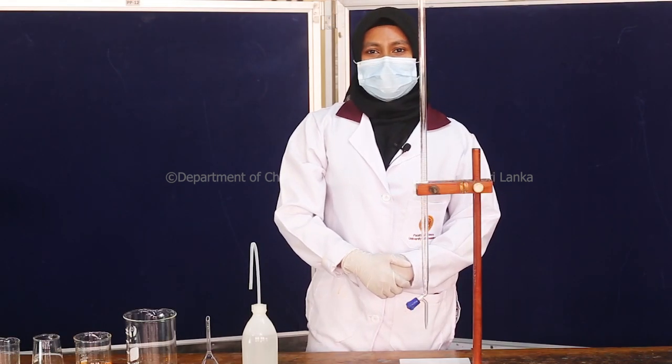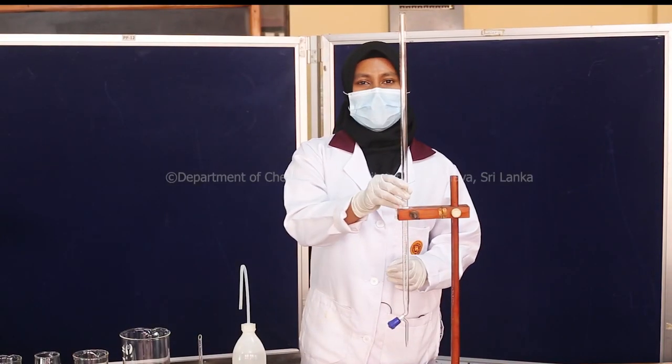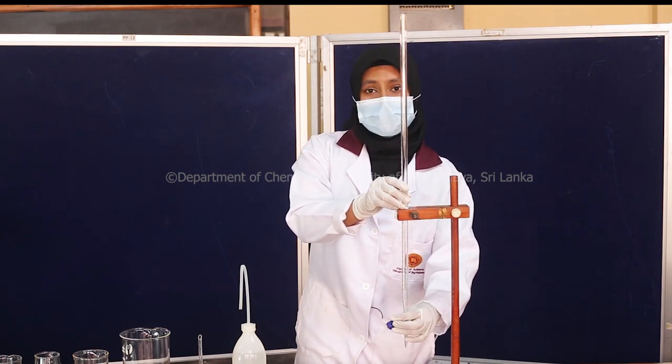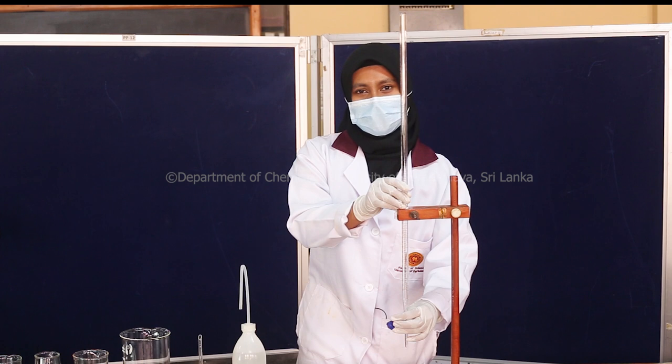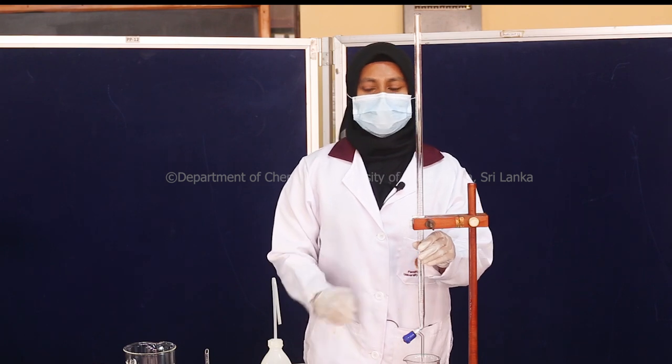It is really important how you handle the tap of the burette in a right way. Always use the non-dominant hand to operate the tap like this, which means if you are right-handed, you have to use your left hand. When handling the burette, initially take the burette and rinse it with distilled water.